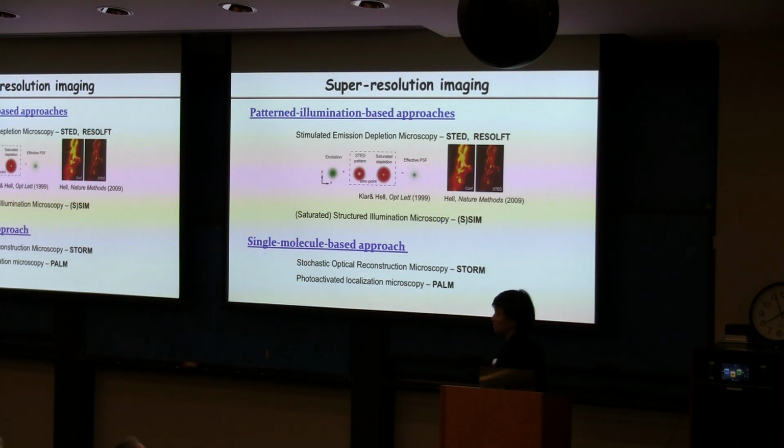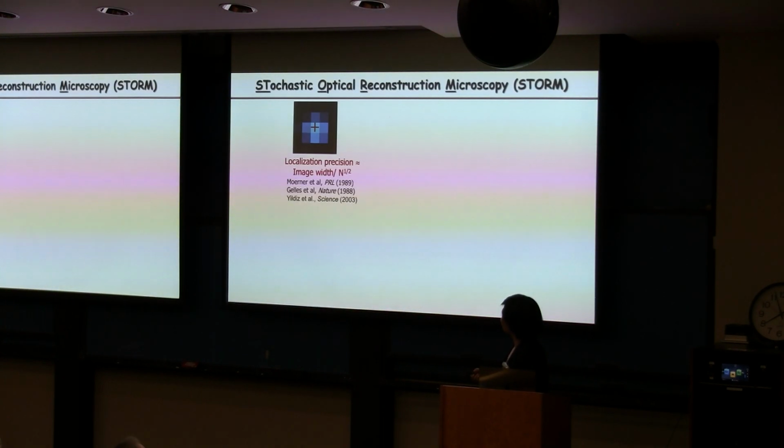Both are pioneered by Stefan Hell at Max Planck Institute. And what I will talk about is the second category, which is single molecule imaging based, and that's what I will primarily focus on today. So let's get to the single molecule approach.